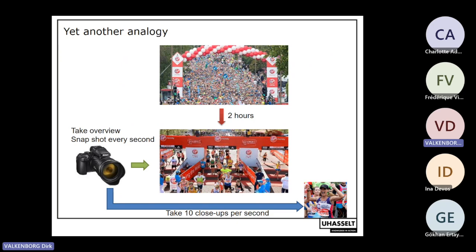So you might decide, okay, let's take the close-up again. That close-up, you recognize the analogy perhaps, is the MS2 scan that we're taking. So that peptide has had a close-up taken twice or even 3 times, depending on how long he wanders around at the exit.